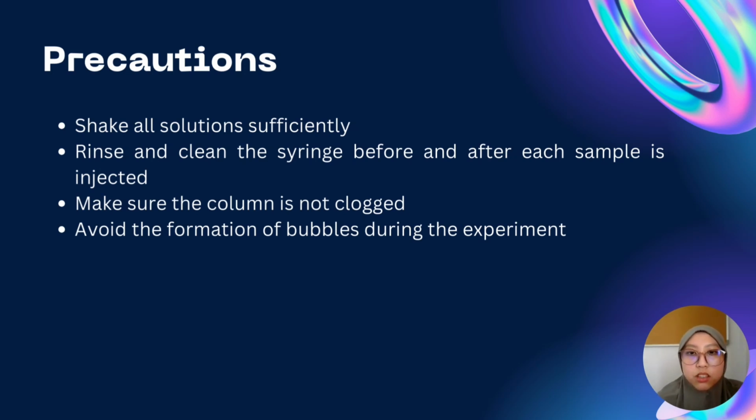To avoid clogging in the column, check for protein precipitation, which may happen when stabilizing agents are removed during fractionation. Lastly, avoid the formation of bubbles during the experiment because when the measurement is taken, any disturbance in the column could have an impact on the reading.